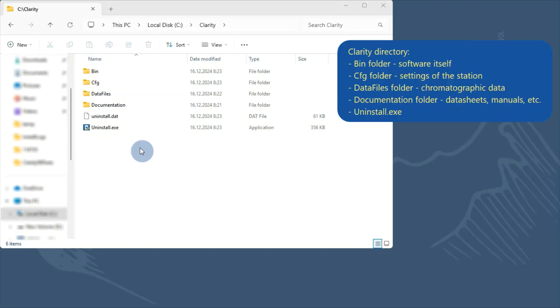There are four different folders. The bin folder, that holds the software itself, including tools like the IQ and Launch Manager. The CFG folder, that contains all the station setting files and audit trails.